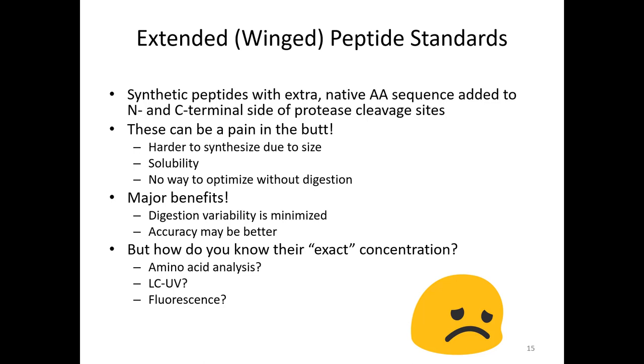When you purchase some heavy peptide from, say, New England Peptide, the vial says 1 milligram. Isn't that about a milligram? It's a milligram if they've weighed it, but how do you know that 100% of that milligram is your peptide? There could be incomplete synthesis products, or degradation products or other things that are accounting for that mass.